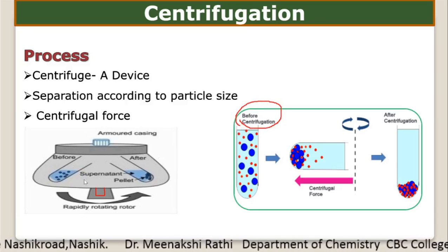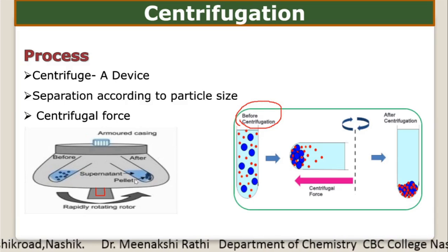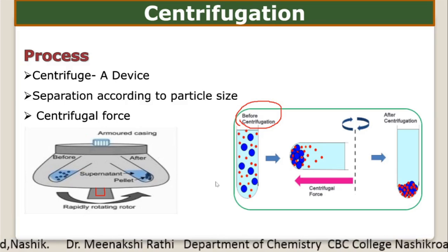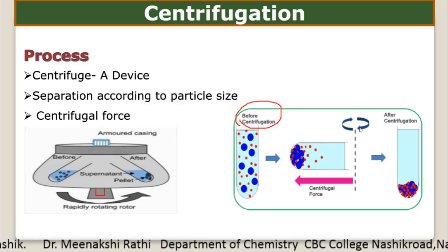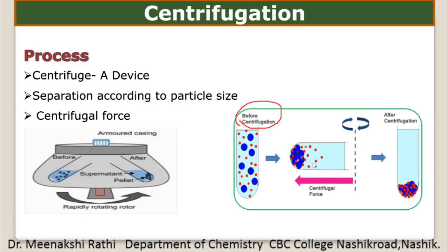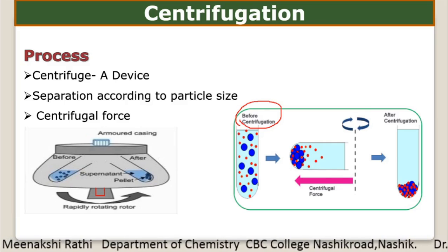Once this tube is kept in the centrifuge and it is rotated, centrifugal force is applied, and due to centrifugal force all the molecules get converted into pellets.